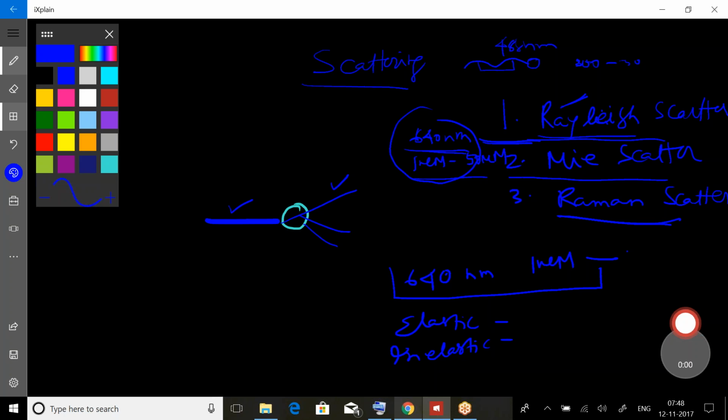I'm not talking about going into the detailed physics and equations, but having knowledge of how it works could benefit us. We can do better and more powerful flow cytometry by having this knowledge. It's very simple; there is nothing that we cannot understand.